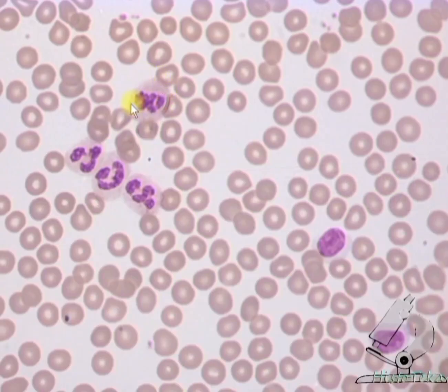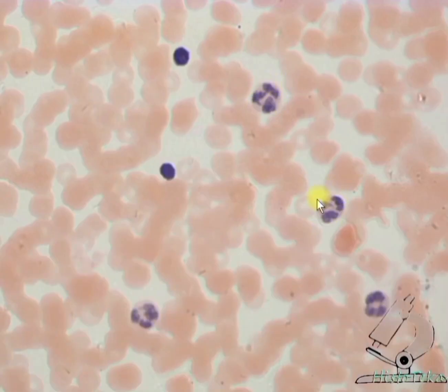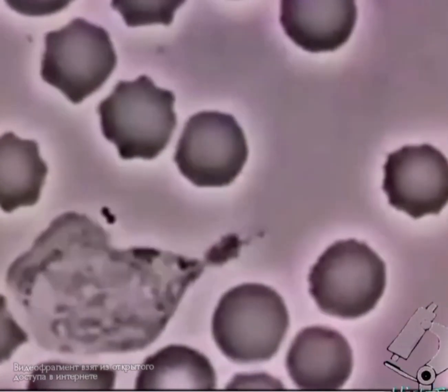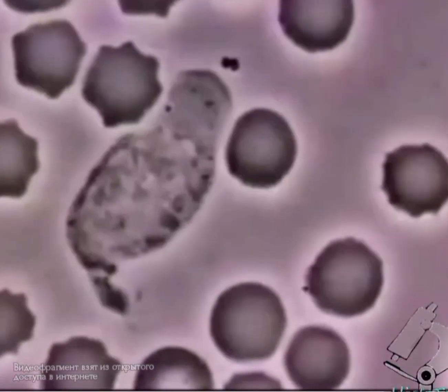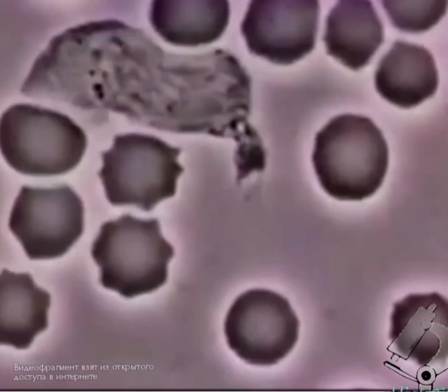Neutrophils are characterized by fine granularity of the cytoplasm, which is poorly determinable at this magnification, so their cytoplasm looks homogeneously colored. Specific neutrophil granules contain various antimicrobial substances, lysozyme, lactoferrin, which help these cells perform their functions, killing microbes. Another name for neutrophils is microphages. They leave the vessels into the focus of inflammation and there they realize their function. They phagocytize and digest microorganisms.